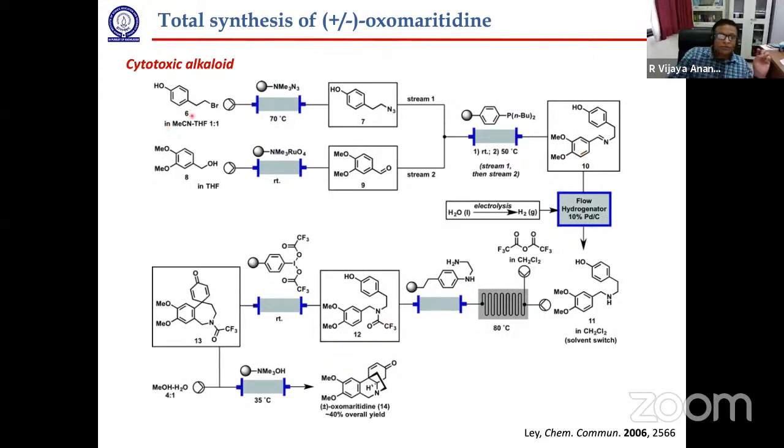How? Because you see here, this is a cartridge, and it's filled with this kind of polymer. This azide is actually a counterion here. It's a simple displacement reaction. Once you allow the reaction to flow into the reactor, only this product comes out.